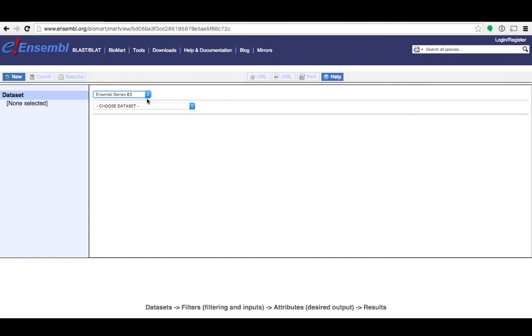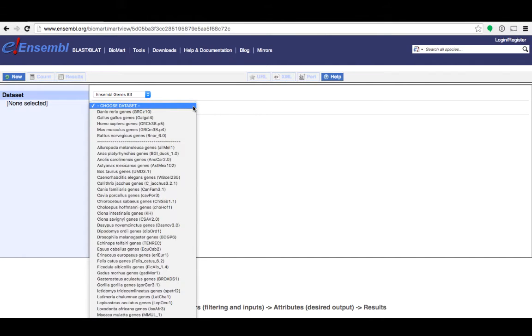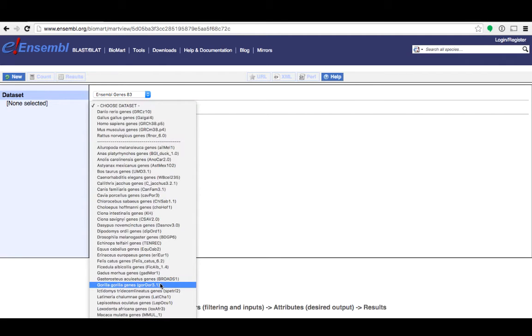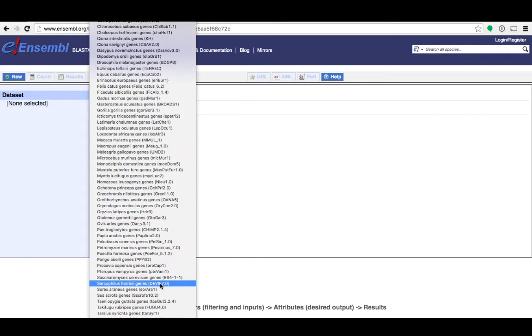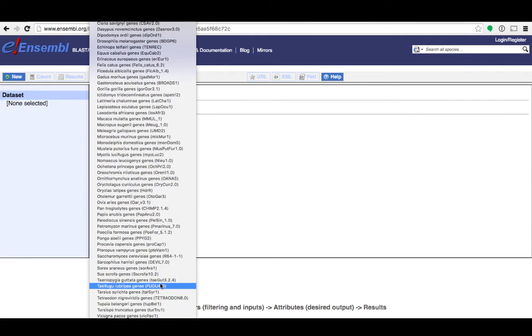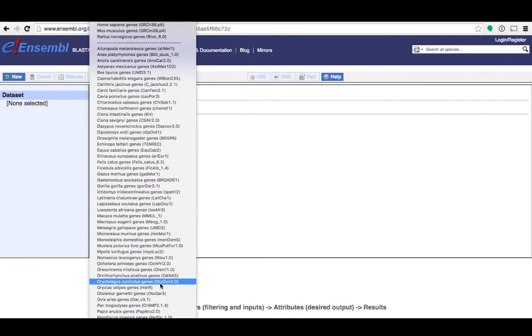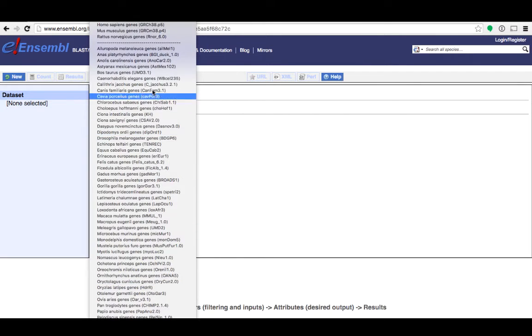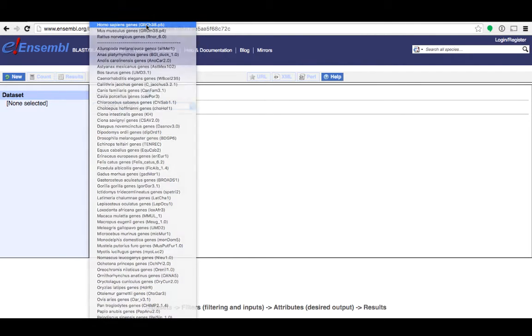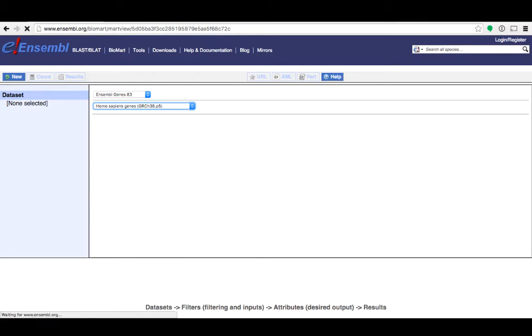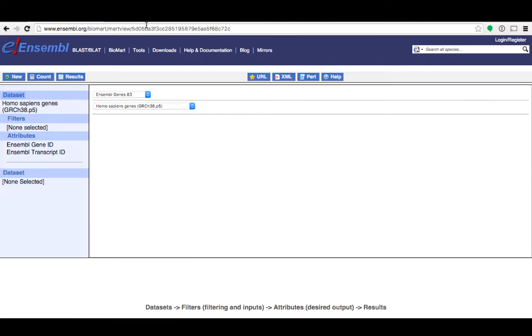Now I need to select my data set. You can choose from any of the genomes we have at Ensembl. But for this demonstration I'm going to choose human genes. This data set includes all of the genes of my selected species.